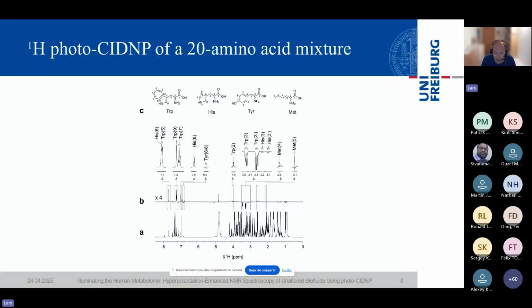Of course, all our critics can argue, yeah, but you lose a lot of information here. And that's true, and I also wanted to make that clear at the very beginning. We are not trying to compete here with any other method. We think this might eventually be a complementary way of trying to overcome the overcomplexity of these NMR spectra, or at least spectra that are difficult to analyze.